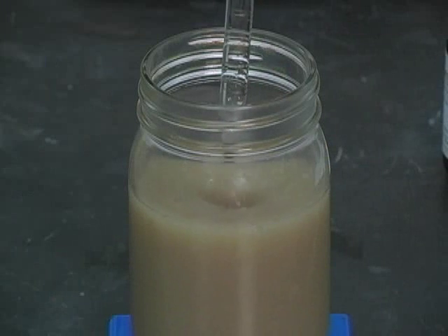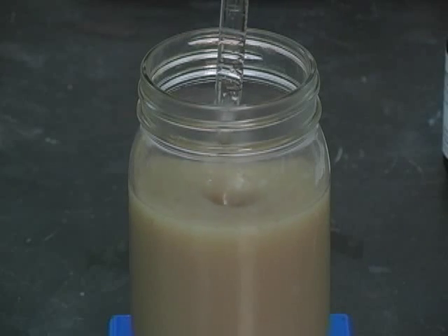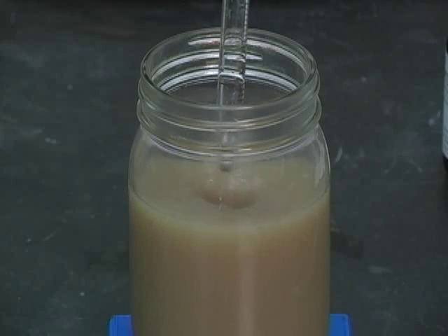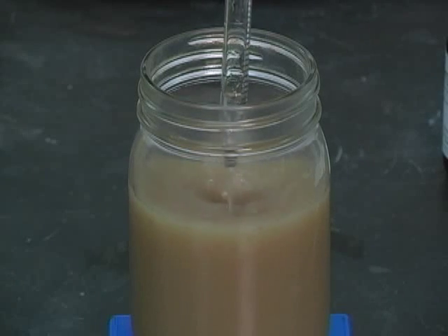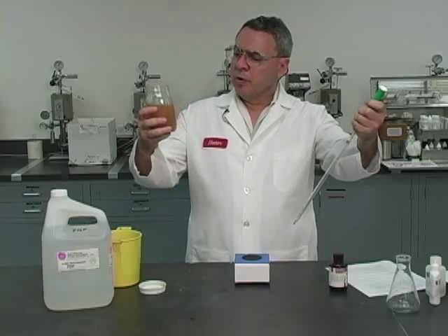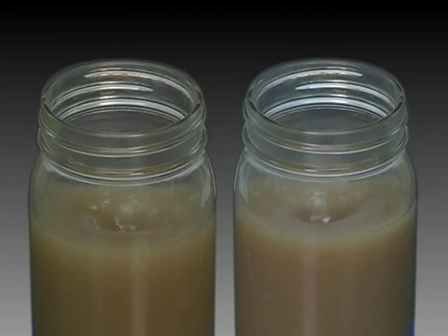Stirring very well. Oh, I can see now that there's a turning point. There's going to be a phase separation, water down, oils and alcohols up. This is the final point. Yes, this is clearly the final point. We are not looking for a very strong pink color, but just a certain tone of a pink or a trace of a pink, and this is it.